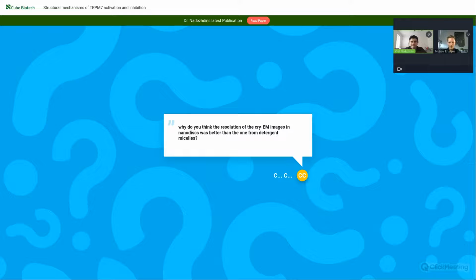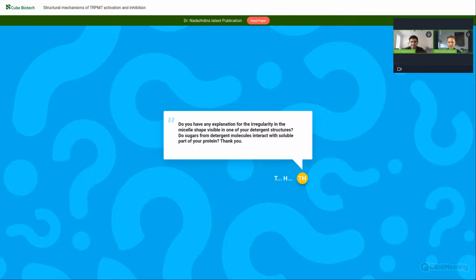Thank you. So the next question is asked by Thomas Heger, and he's asking, do you have any explanation for the irregularity in the micelle shape visible in one of your detergent structures? And do sugars from detergent molecules interact with the soluble part of your protein? Yeah, this is a very good observation. I would rather not pay much attention to the shape of the micelle around the protein.